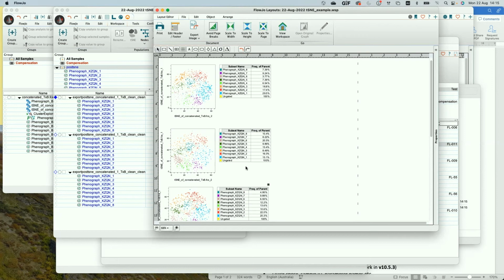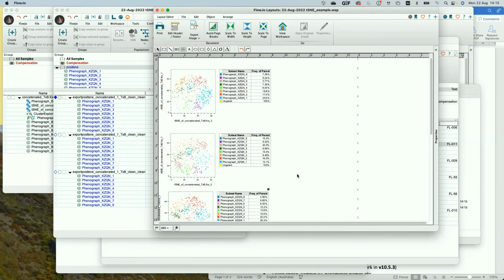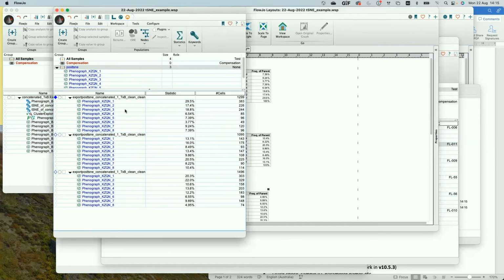No worries. Just another question, Laura. You can treat this exporting tool and importing as a file as a way to essentially export all the samples that are within a given group. So essentially, you treat the group as an independent file to see global changes between groups before you go into specifics, to see if you have an outlier in the group or something like that.